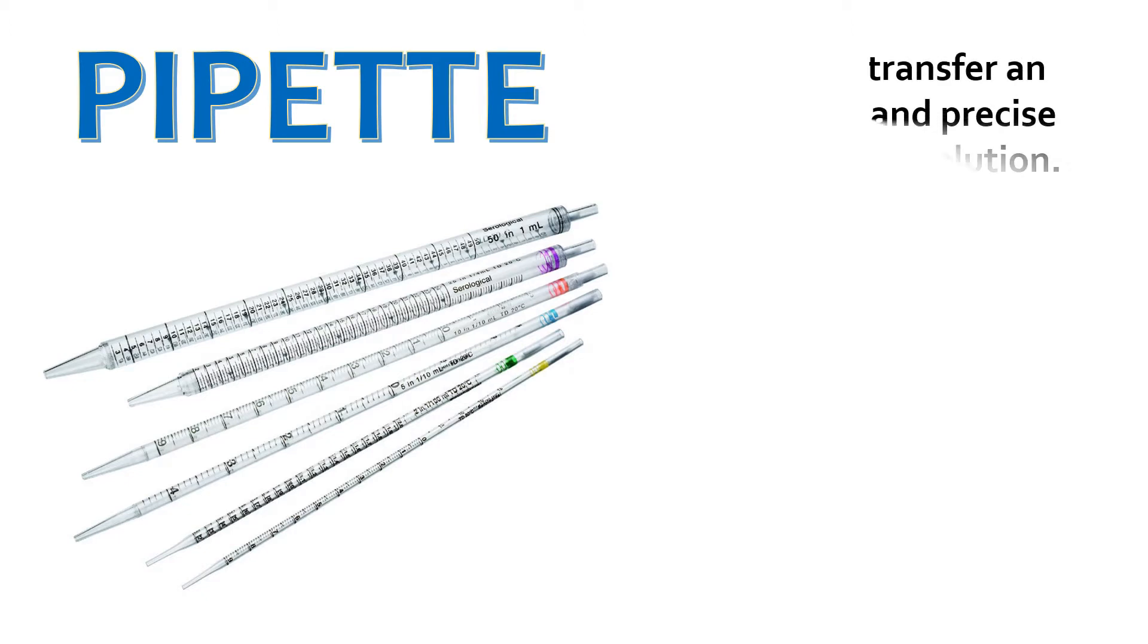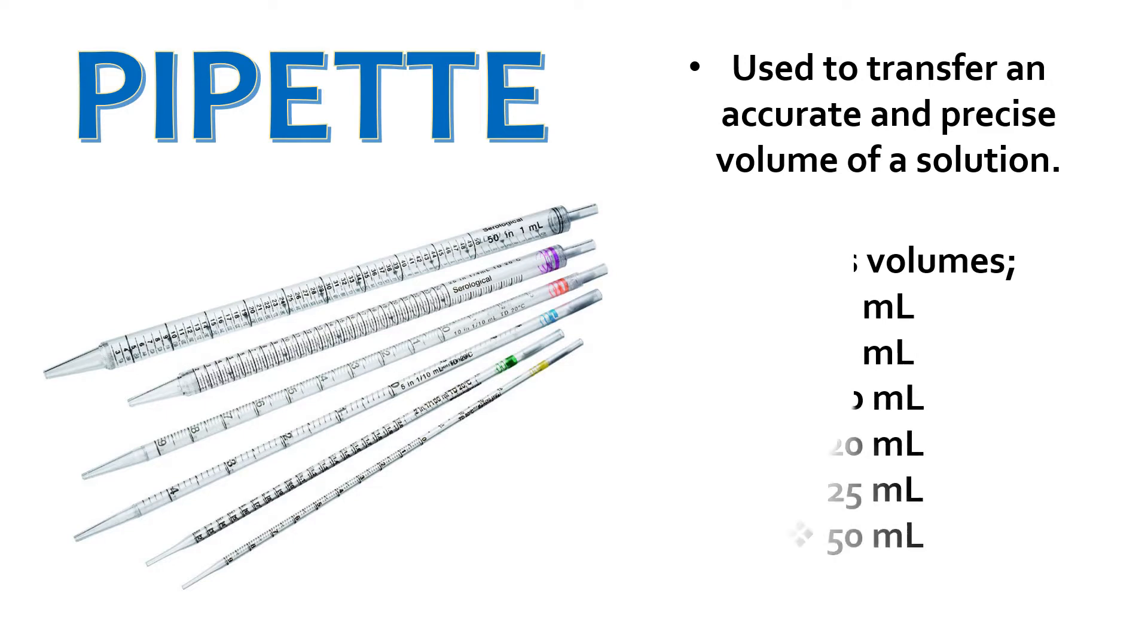Pipettes are used to transfer an accurate and precise volume of a solution. Pipettes come in various volumes: 1 ml, 5 ml, 10 ml, 20 ml, 25 ml, and 50 ml.